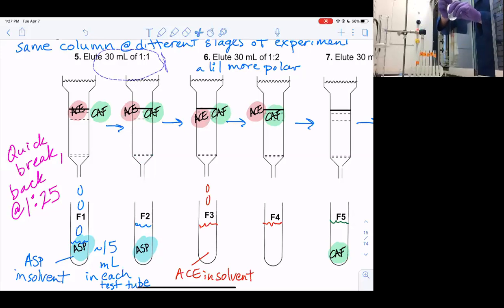And you can hear Victor adding ice into our bucket for the rotovap. We're just repeating the same process as before, where we pipette in the first couple of amounts, make sure there's a good amount, look it over the top, and then at that point take the beaker and very carefully pour. Not all the way up to the top, just to where we're comfortable. For me, that's right about there. As this continues to drain, we'll continue to add solvent.